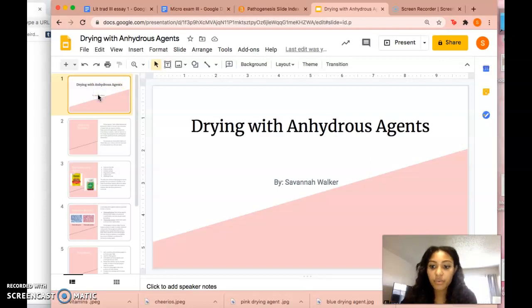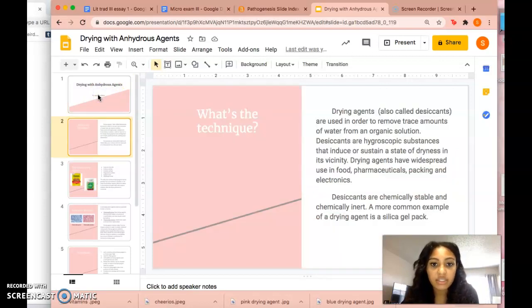This is my video for drying with anhydrous agents. So what's the technique? Drying agents, also called desiccants, are used in order to remove trace amounts of water from an organic solution. Desiccants are hygroscopic substances that induce or sustain a state of dryness in its vicinity.